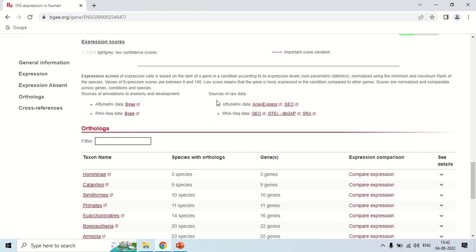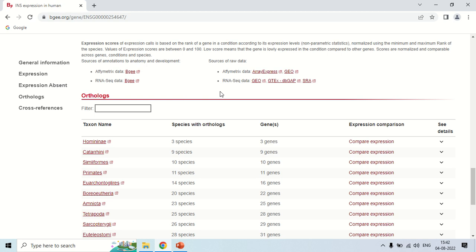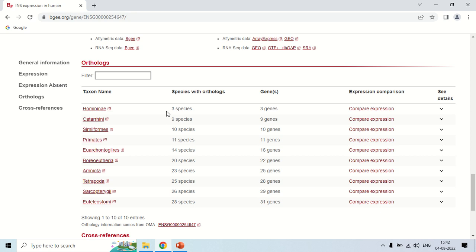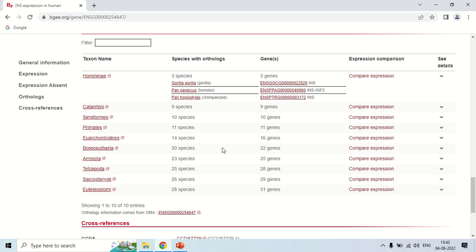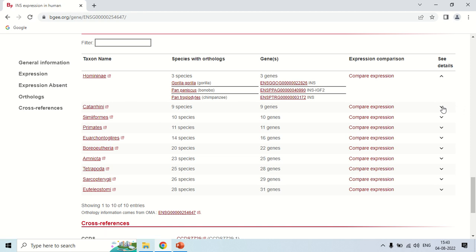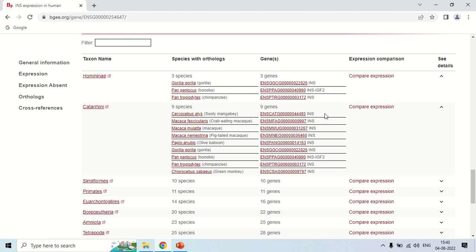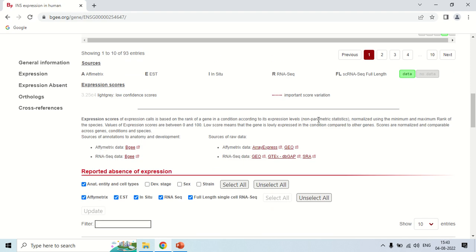If you scroll down again, these are the orthologues — genes which have the same functions in different organisms. Here are the different taxon names. For Hominidae, there are three species which have orthologues of insulin with three genes. Clicking here shows the comparison of these three genes — gorilla, bonobo, and chimpanzee. You can click 'compare expression' to compare the expression of these three genes. Similarly, for the next taxon there are nine species, and clicking shows the information for all nine genes.